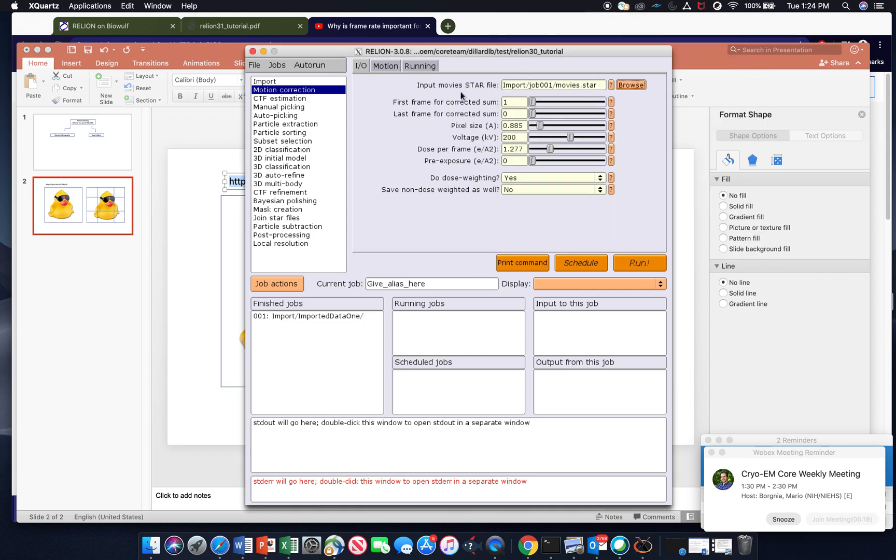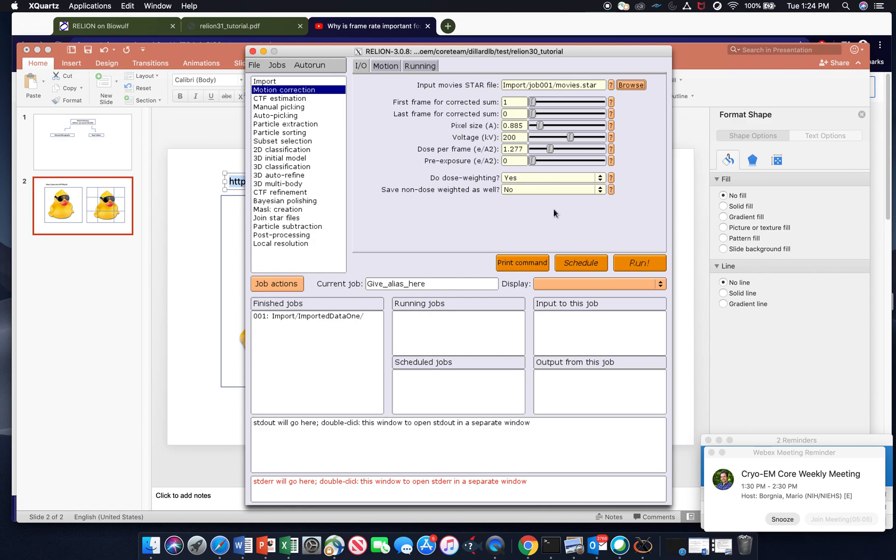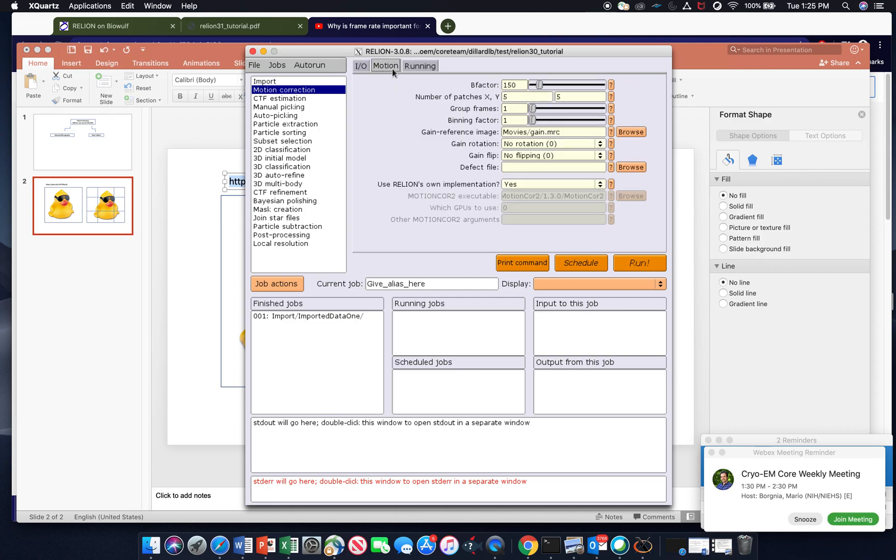So the next thing you have to do is input all of the parameters that were used to collect the micrographs. And that will be given to you by whoever collects the data. So it's important to get the pixel size right and the voltage. And all of these values for the test data set come from the Reliant tutorial that I showed you earlier. And these are the parameters for that data set.